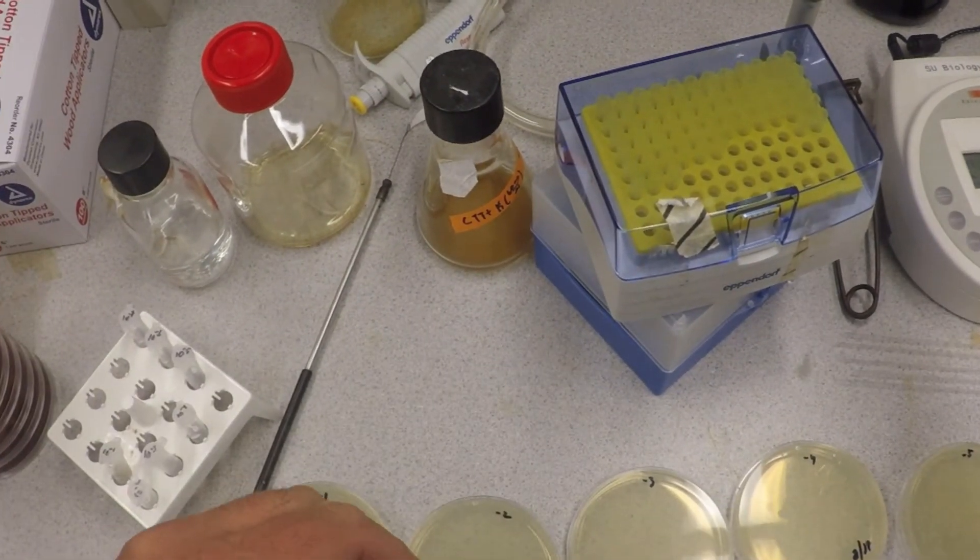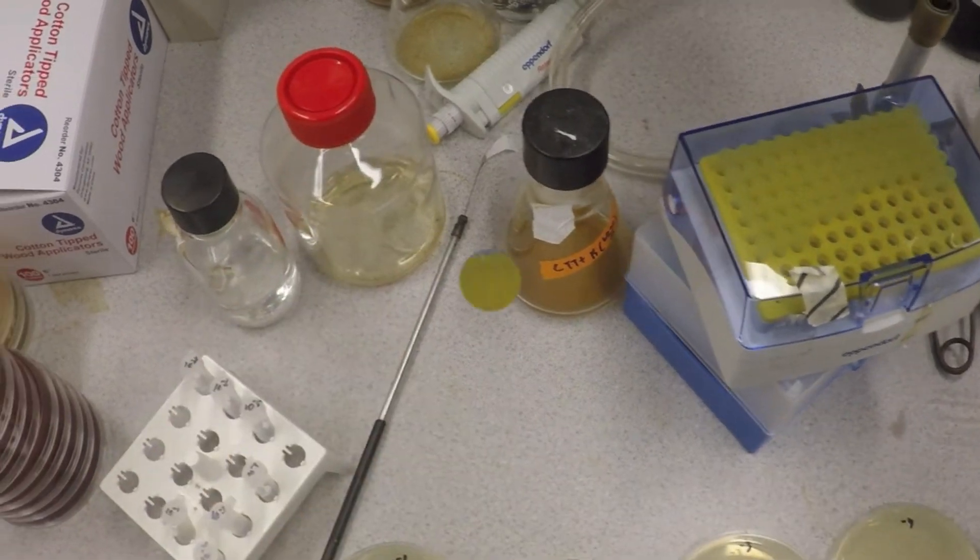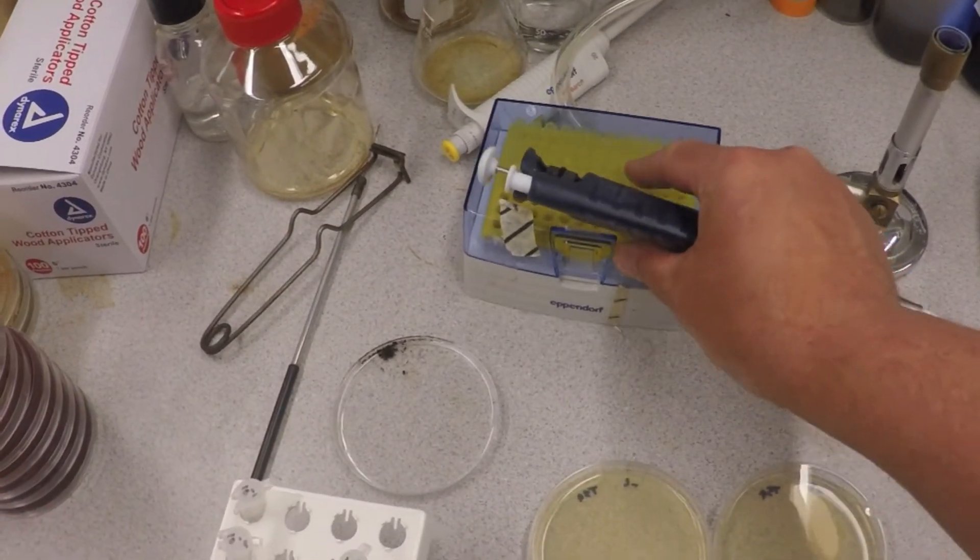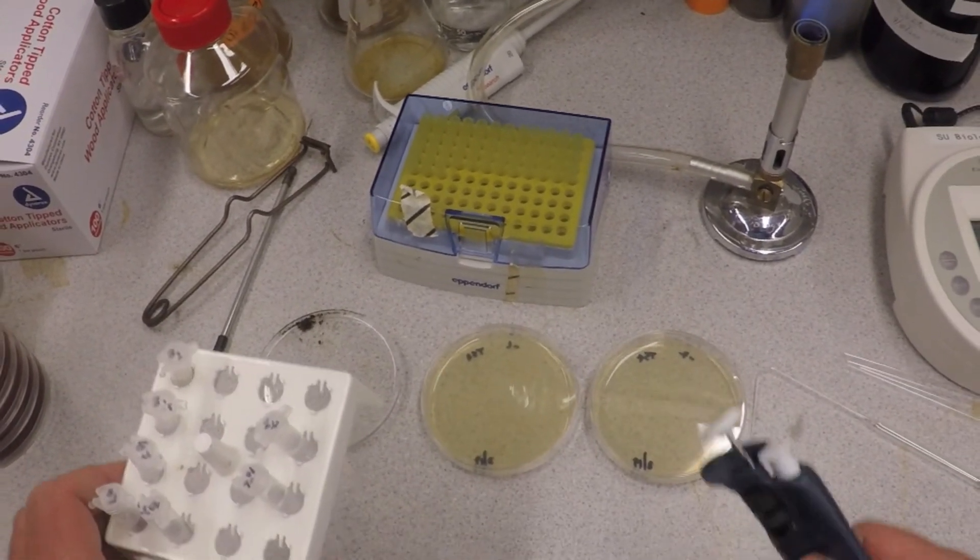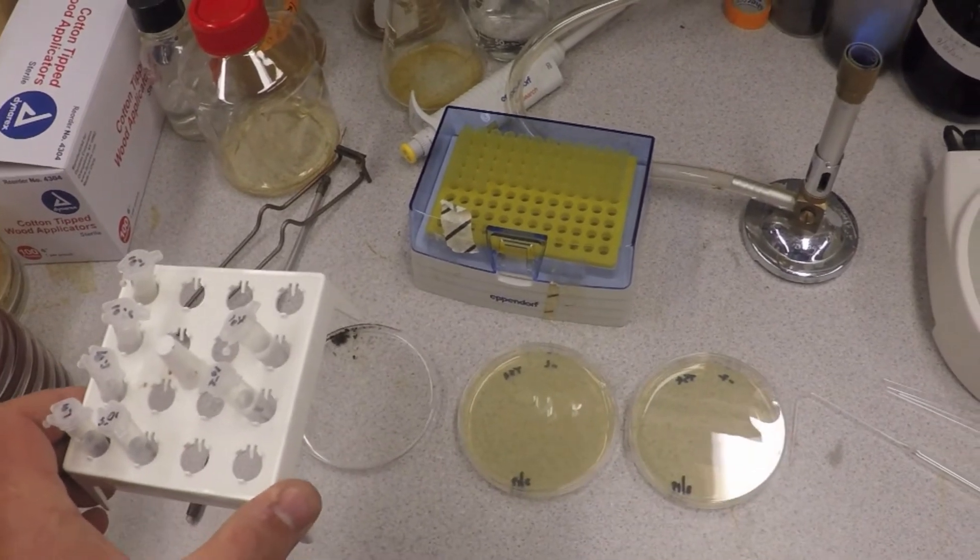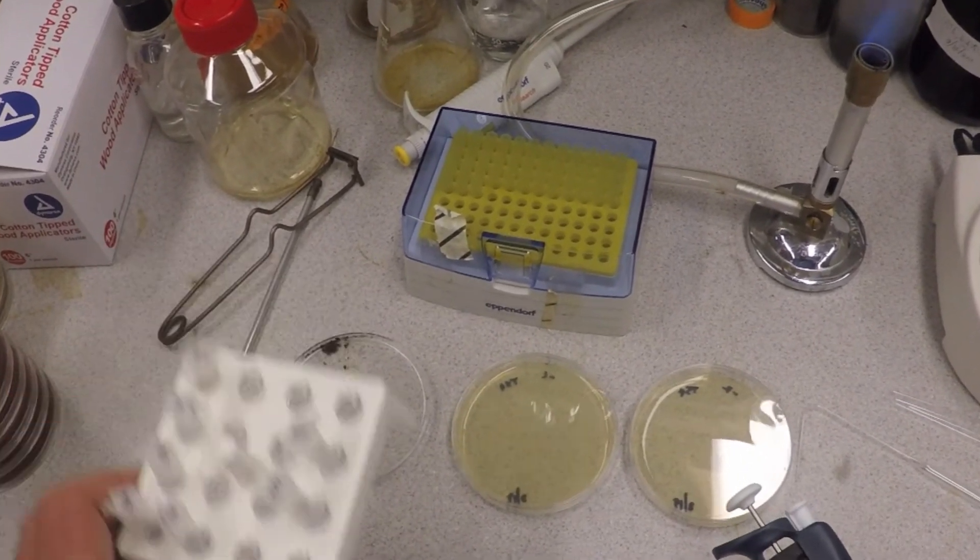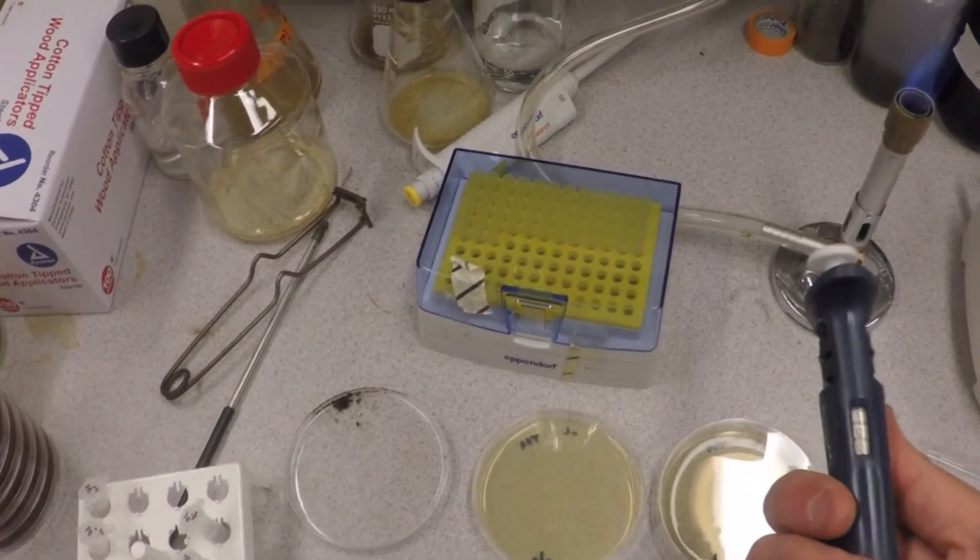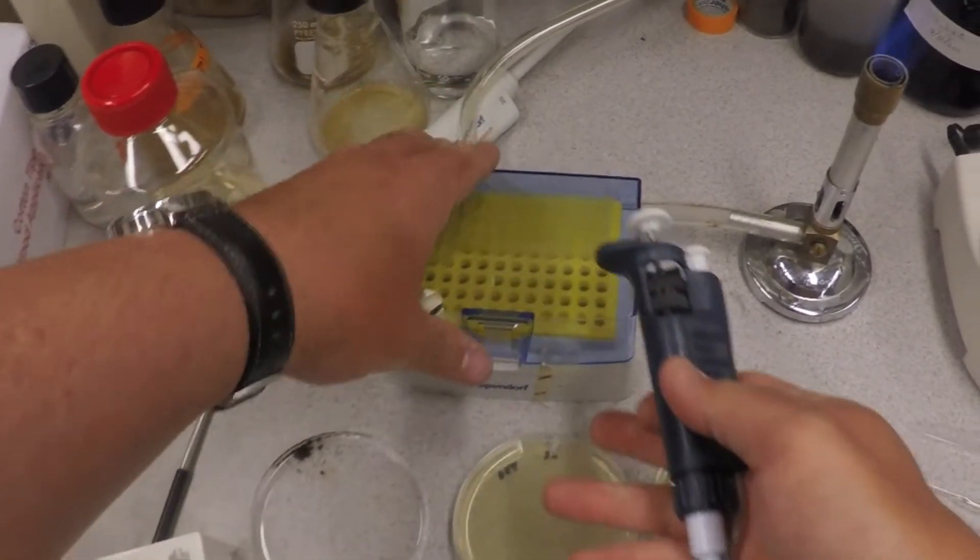Made your dilutions. Now once those dilutions are made, you need to plate these in volumes onto your plates and spread them out to count colonies. So what do you do? You take 100 microliters from your dilutions.